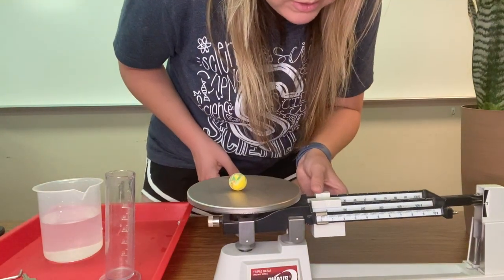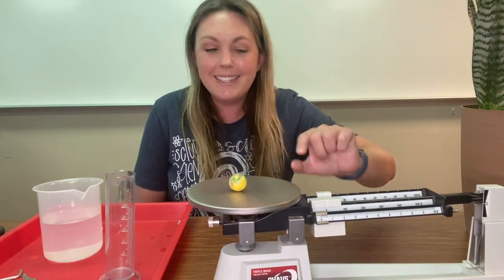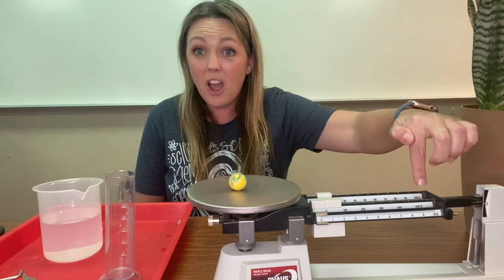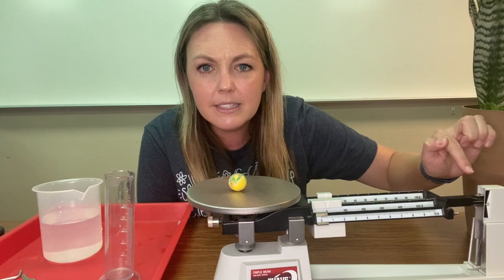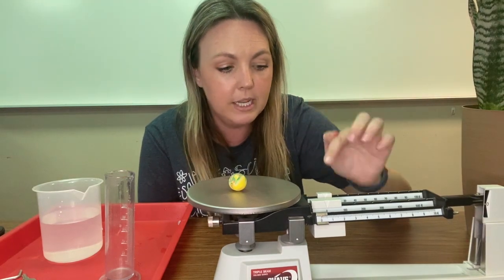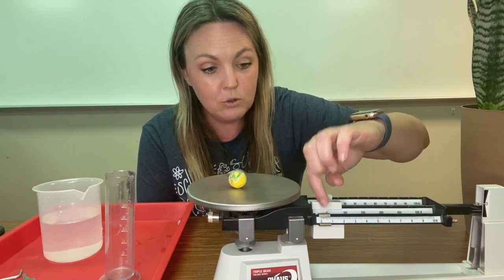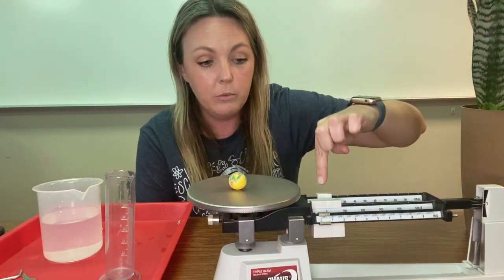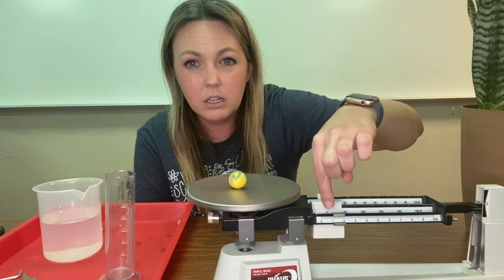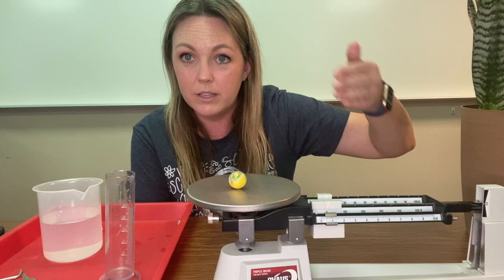So we're going to start at 10, because we know that 10 was not enough mass to balance out our triple beam balance. It seems like we still have a little bit to go, and instead of continuing to go by 10s, I want to go by ones again — just like counting nine, 10, 11. We have 10 in the back, and then each single digit number here would be like counting up by ones again.